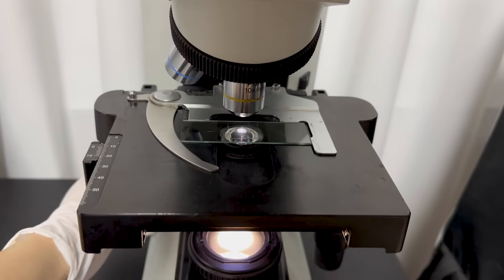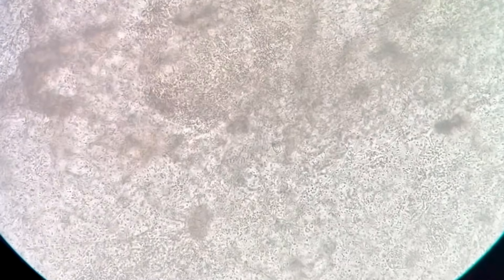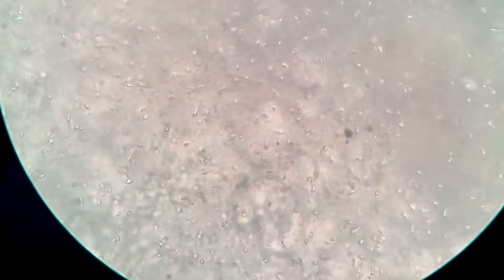So I used my microscope for a closer look. At 40 times magnification, I could see that all the tiny moving things were sperm. Zooming in more, I could see lots of sperm swimming, and I was relieved to see so many healthy-looking ones.